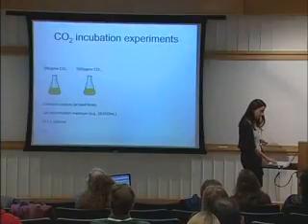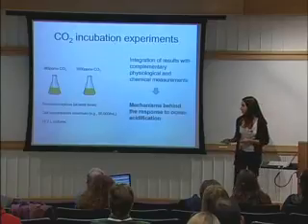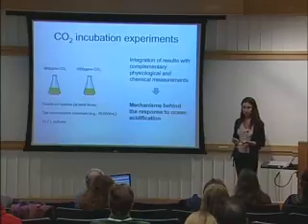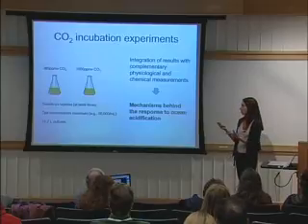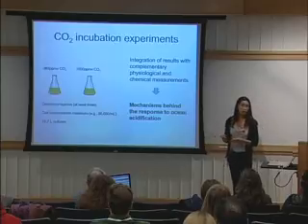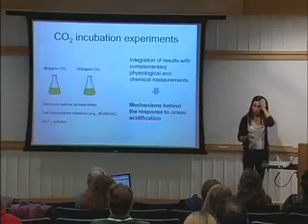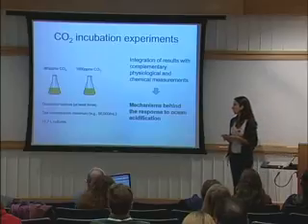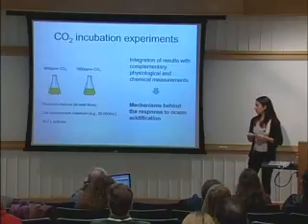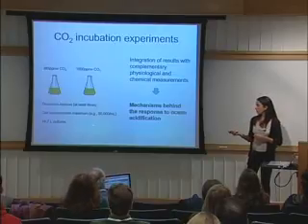When you run an experiment, decide on the number of replicates that you want to have, and you should have at least 3. We tend to have more. This is for proteomics, but we tend to have 4 replicates. And just think about your cell quotas and the maximum cell density you can live with in your culture for whatever conditions you want. In our case, we try to keep them below 50,000 cells per mil. We grow just under 15-liter cultures.